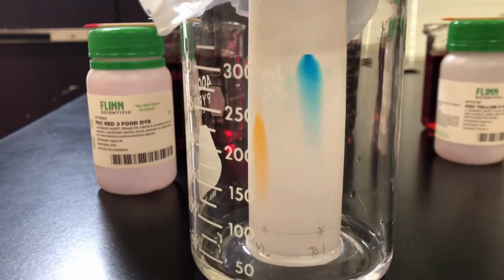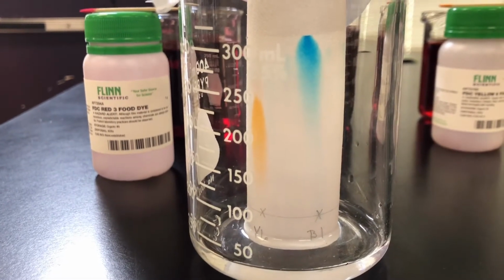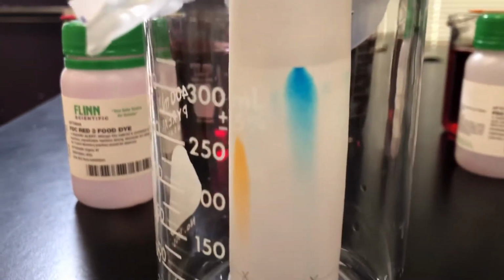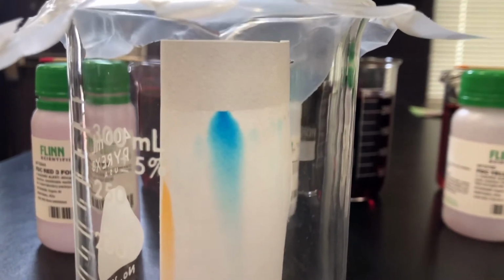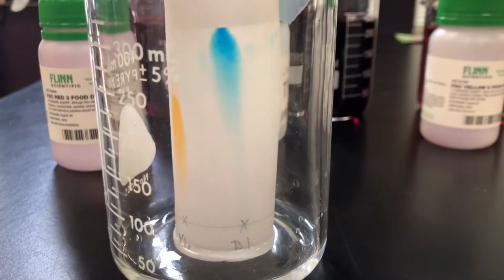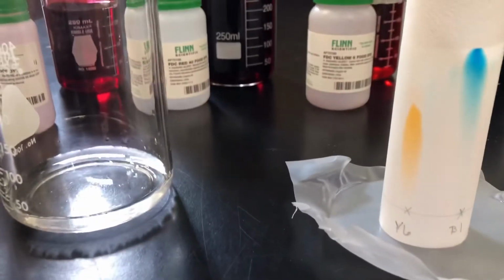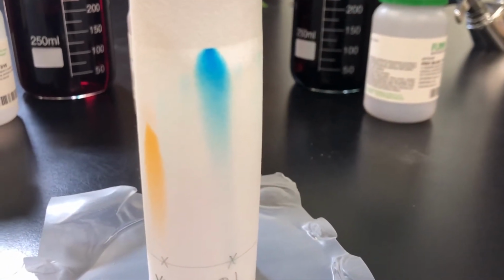So please don't interpret that any other way. Okay, so it's been about 15 minutes since we started this chromatograph. This is our original with the FD&C colors. One of the things we want to make sure we keep an eye on is the solvent. We do not want it to get to the very top because then it runs out of space. So we want to make sure we stop this and take it out before it reaches the top. Otherwise, we would have to start this all over again. So what I've done to stop it is just took it out of the solution and just set it here on the parafilm so that it can dry out. Then we can start doing some measurements.